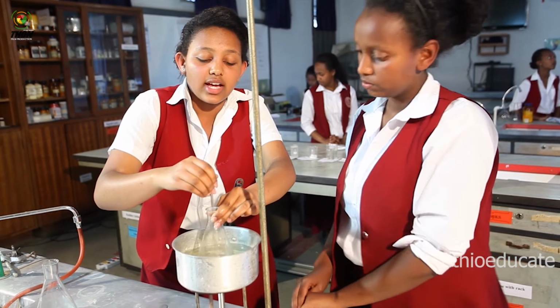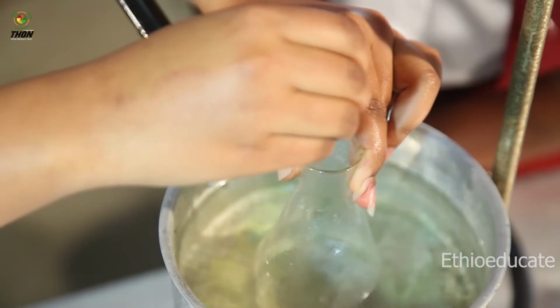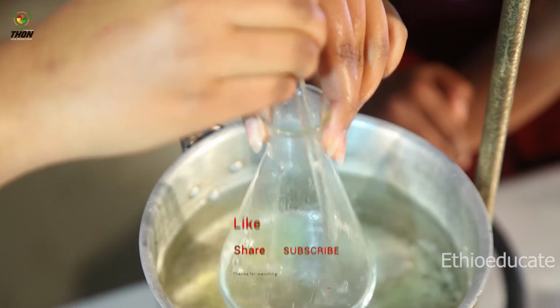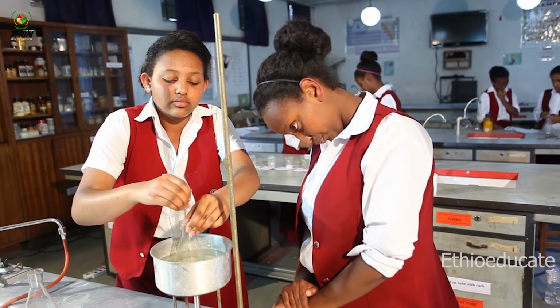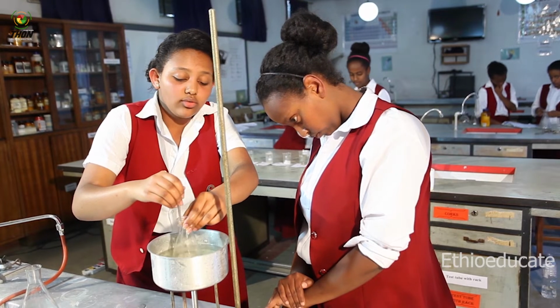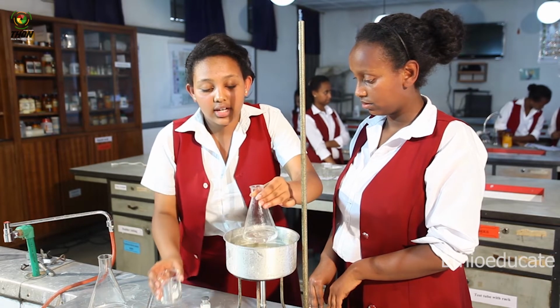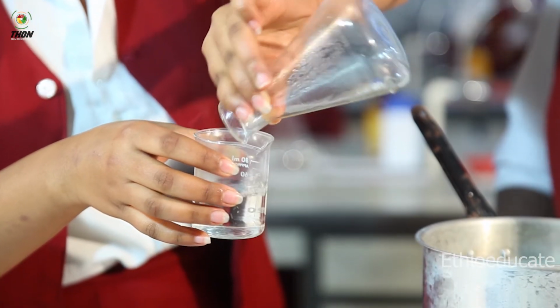As I said before, as the temperature increases, the amount of solute that dissolves will increase too. That's why it's dissolving more and more? Yes. Now that it has fully dissolved, I'm going to pour it into my beaker here. In fact, at this stage we were supposed to filter it, but I'll just pour it into my beaker here.